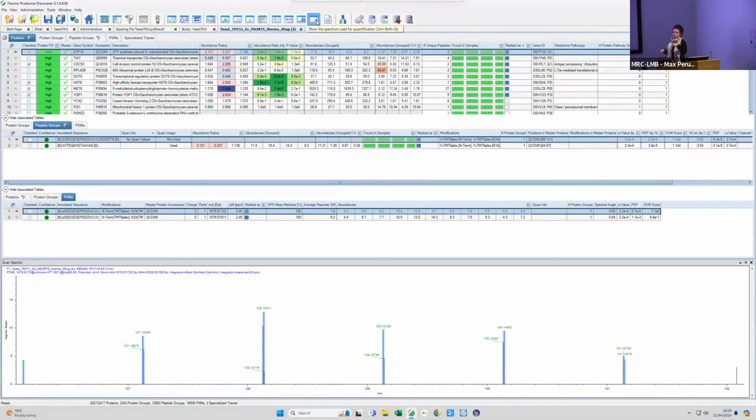Do you remember when I said we do the MS2 for the identification, we see the fragments of the peptides, and establish a PSM? What the instrument then does is go through another round of fragmentation. It selects the 10 most abundant fragments, the ones that still have the reporter ions attached, to do this third round of fragmentation. The only reason we collect data this way is to minimize co-isolated peptides, so we don't have interference from peptides that are not coming from our protein. So when you do the third round of fragmentation to get the reporter ions, this is exactly what you see.